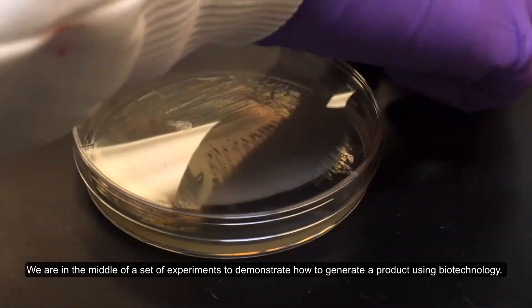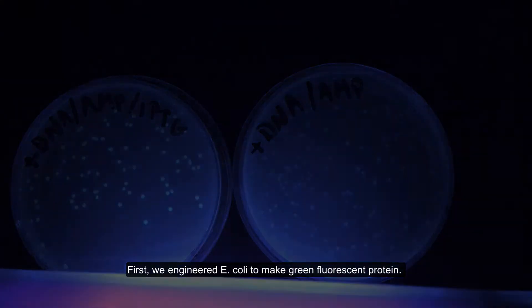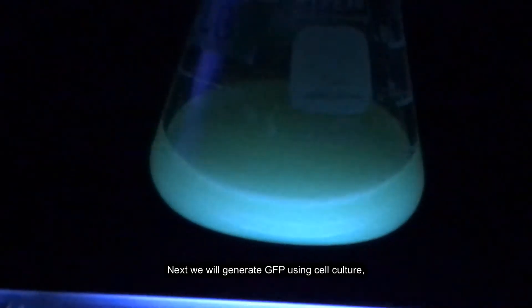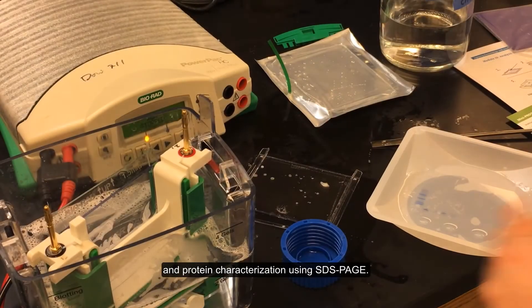We are in the middle of a set of experiments to demonstrate how to generate a product using biotechnology. First, we engineered E. coli to make green fluorescent protein. Next, we confirmed insertion of our gene of interest using colony PCR and agarose gel electrophoresis. Next, we will generate GFP using cell culture, followed by purification using chromatography, and protein characterization using SDS-PAGE.